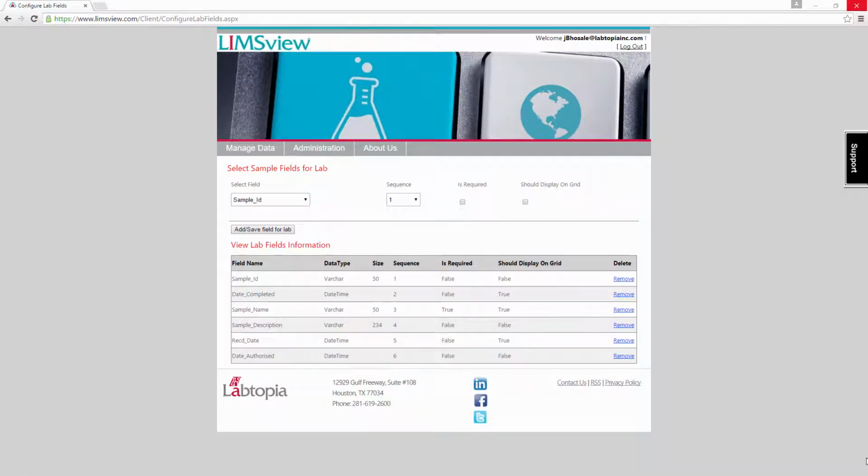We now have 5 sample fields that are displayed to the customer. However, you can actually add additional fields if you would prefer. You also have the ability to remove a field. You can see what type of data field it is so that you can actually modify it based on the information that you would like to provide. Some people may choose to only provide the sample ID and the status, and some may include whether it has a report. Basically, this is whatever suits your needs.